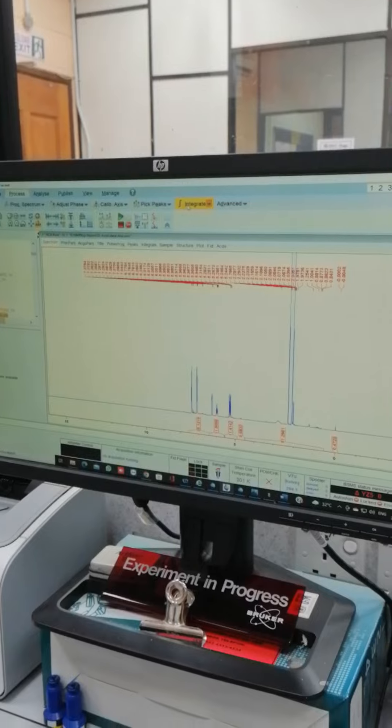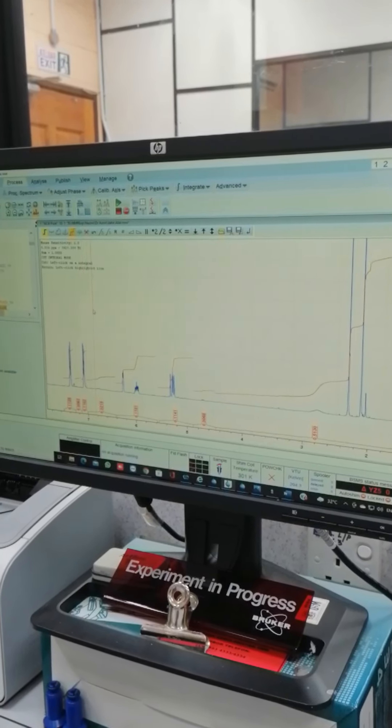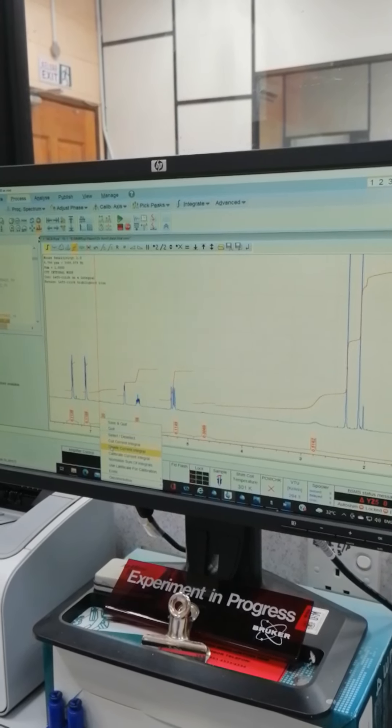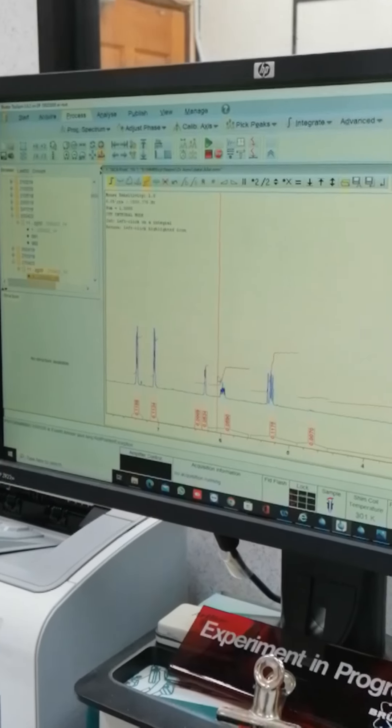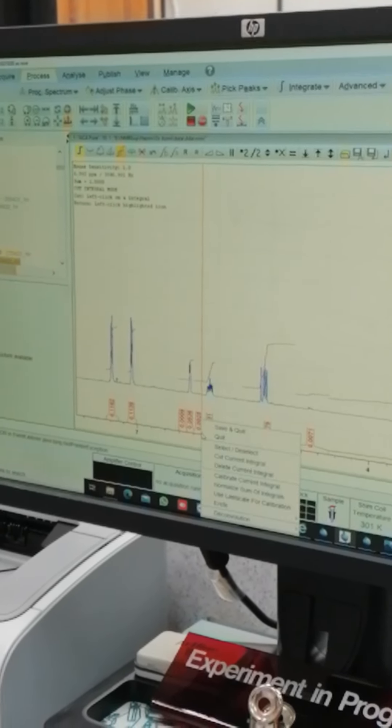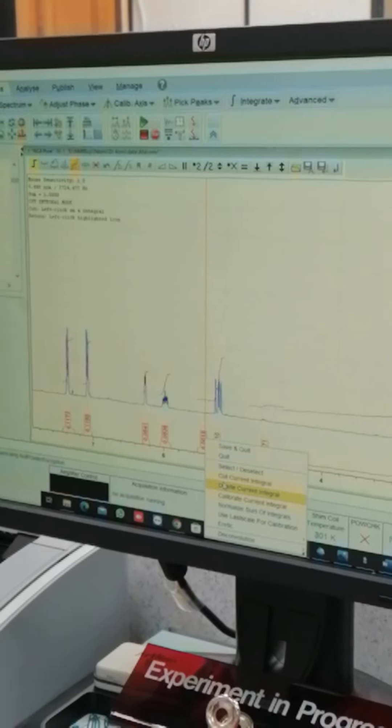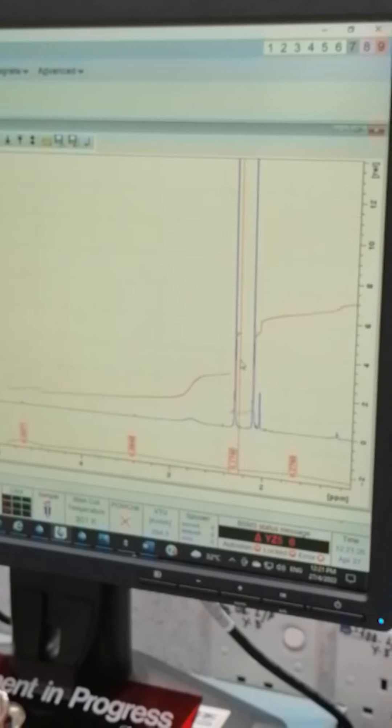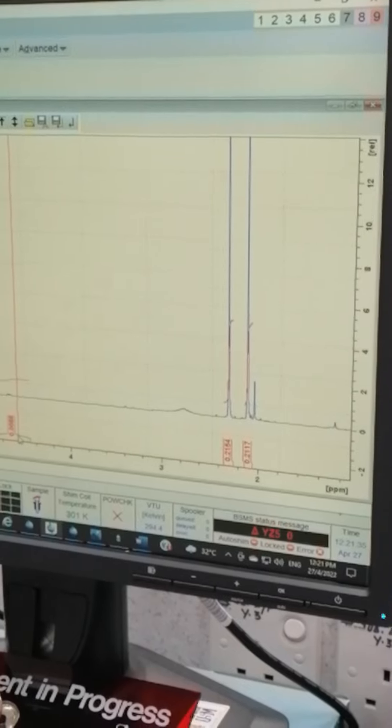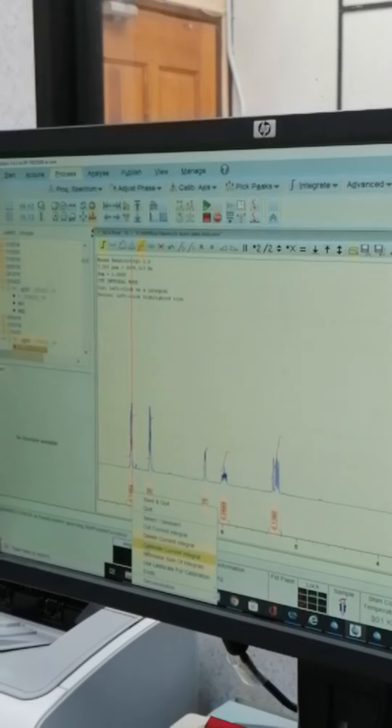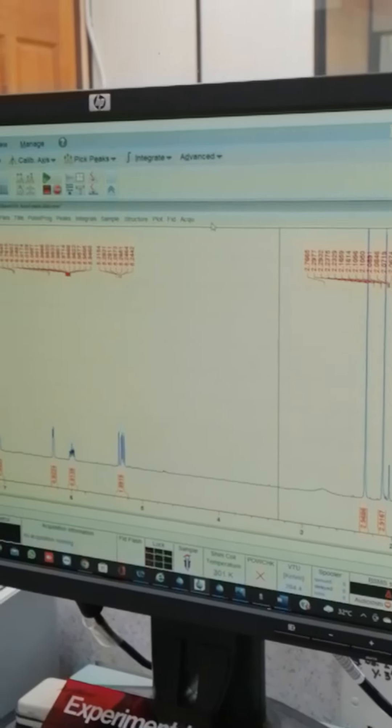So we are doing peak picking and integrations. We are doing first for integrations. We have two methyl groups there. And we select one as a reference. We select this one as a zoom program. So it automatically calibrates all the spectra. So we have to save these spectra.